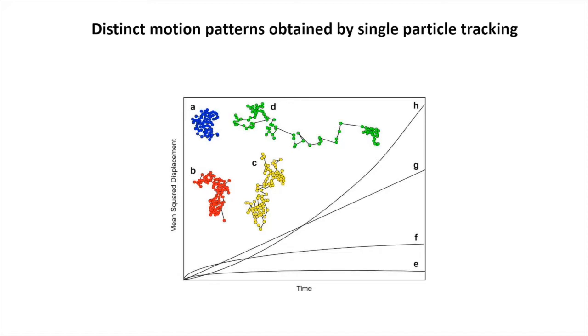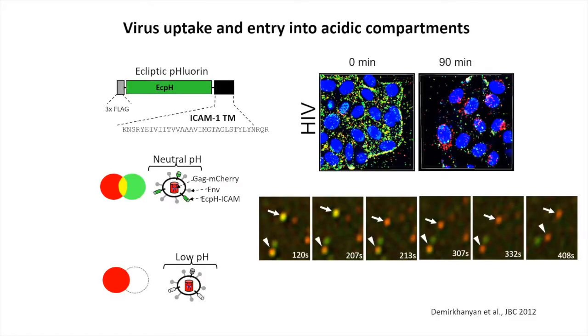So this is an example of different single molecule localization trajectories, and you could distinguish, by looking at mean square displacement and other ways of analyzing it, directional movement from restricted diffusion or normal diffusion. So you can tell locally what molecules are experiencing, and that could tell you about interactions, transient interactions, and active transport.